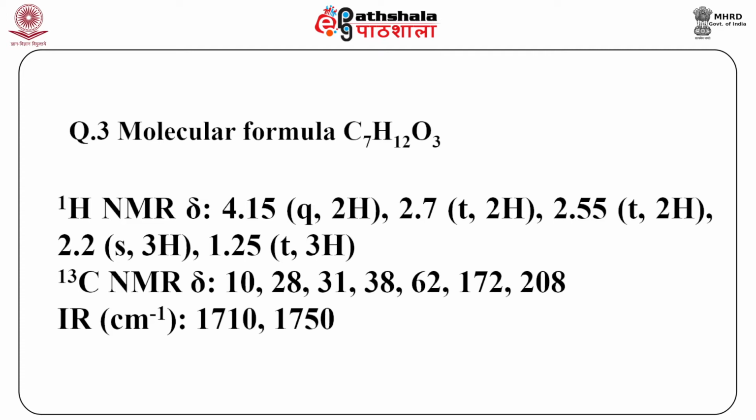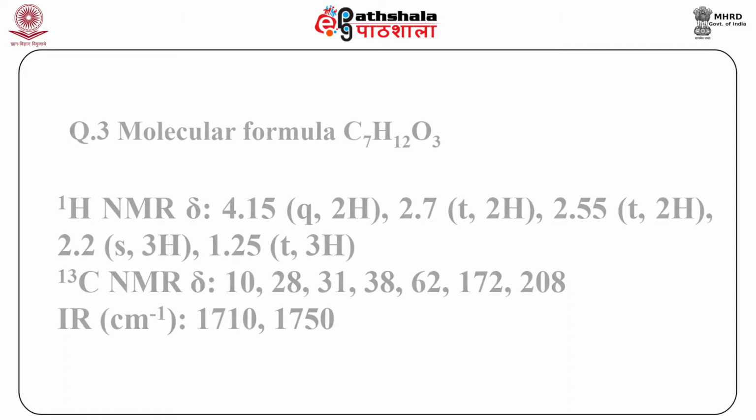The carbon 13 NMR spectrum shows peaks at 10, 28, 31, 38, 62, 172 and 208 ppm. The IR absorptions are observed at 1710 and 1750 centimeter inverse.